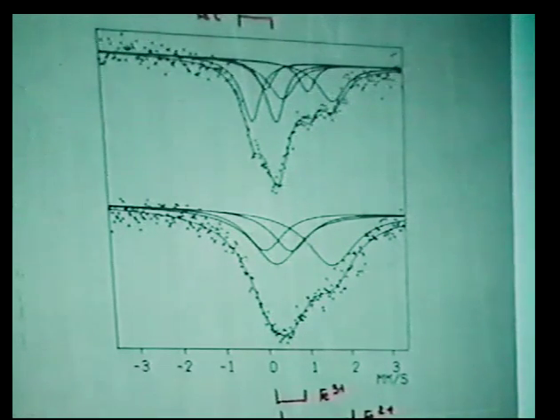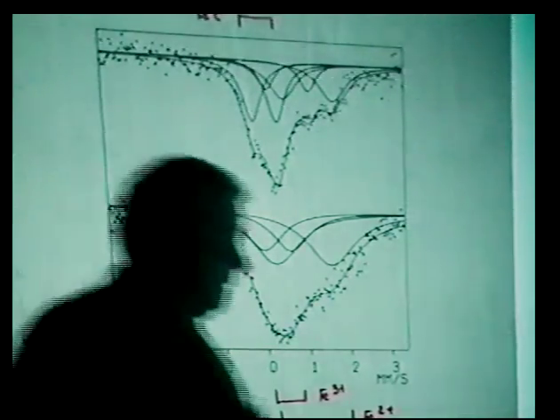And then we switched off the carbon monoxide from the stream. We found only methane formed, so there was no higher hydrocarbon formed after switching off the CO. So it means that some carbon, probably the inactive or immobile carbon, was still present on the surface, but by switching off the CO from the system, this reactive carbon was stopped. Now, I think the next slide.